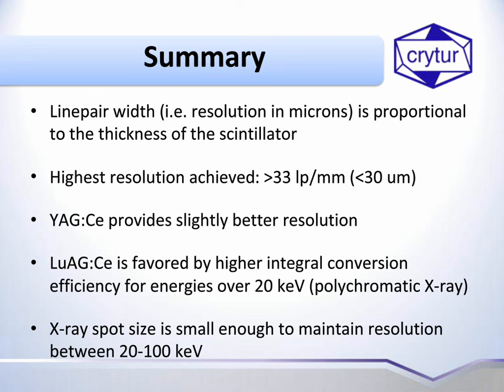Okay, great. Thank you. What solutions do you suggest to couple scintillators and camera detectors together? Well, there are basically, I'd say, two solutions. The first one would be using microscope objectives to couple the scintillator to a CCD camera, or the second would be using FOP as we are talking about today, so we can put it on top of the FOP and directly image on the scintillator, using FOP to guide the light to the sensor.